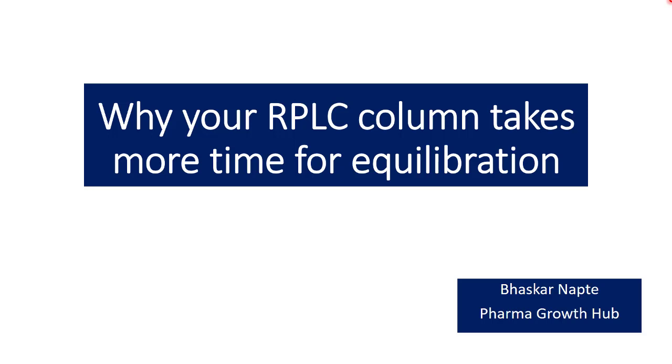Column equilibration is very essential in reverse phase liquid chromatography or even in normal phase liquid chromatography, because without appropriate column equilibration one cannot expect a smooth baseline — and that is the very first indication of whether the system is suitable for further analysis. Sometimes column equilibration takes longer than the analysis time, and even spending long hours may still result in surprises during analysis. In this video, I am explaining the reasons why a column may not equilibrate properly, along with some remedies.